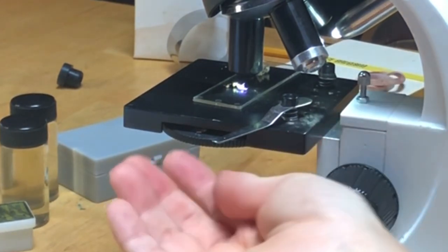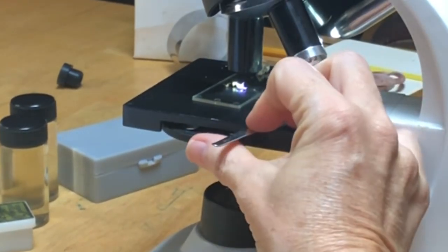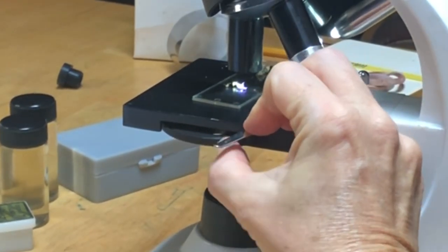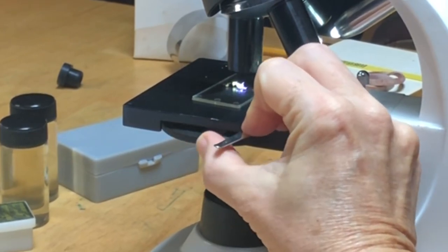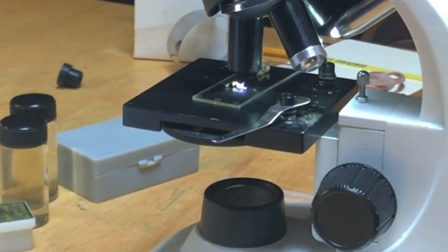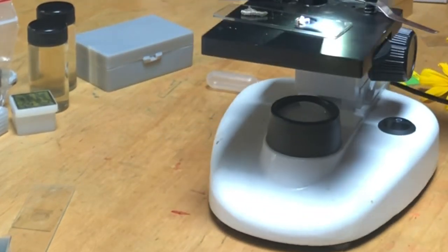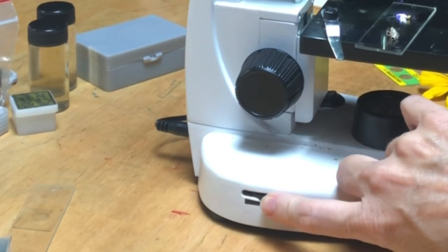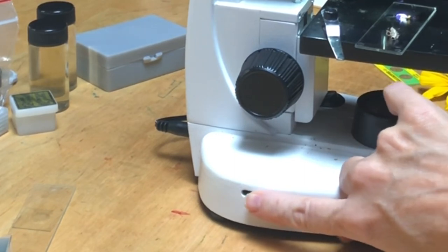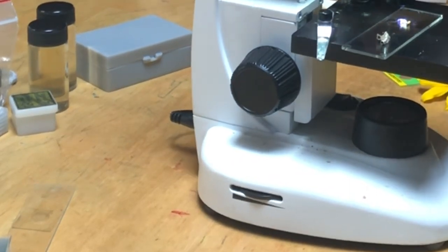On my compound microscope there are two ways to adjust the light that comes in. I have this right below the stage that has a series of holes in it that are different sizes that adjust the amount of light, like an iris, that can come up through the stage. And then on the bottom here, let me see if I can turn my microscope around, I have this dial here that controls the brightness of the light.